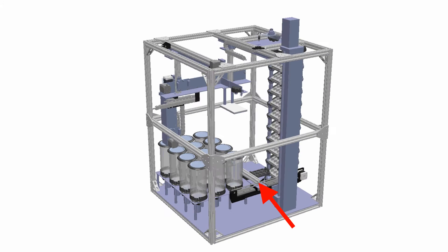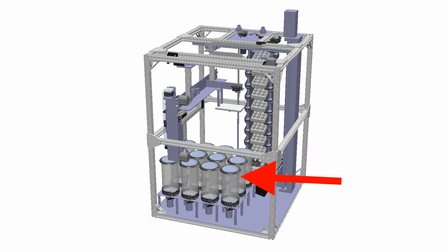The well plate arm moves the well plate between the nutating tower and the other stations. The 12 1L beakers contain the different bacterial suspensions which are added to selected wells. The magnetic stirrer motors keep the bacterial suspensions from settling in the beakers.